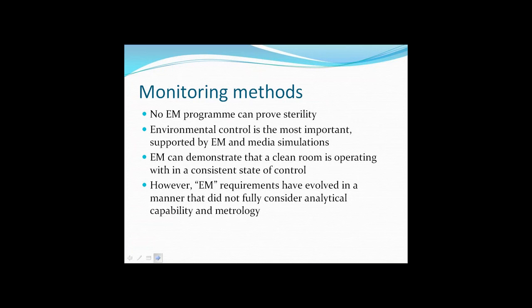It also adds a further caution: environmental monitoring requirements have, in many people's eyes, including regulators, but also the way microbiologists are perhaps sometimes interpreting the data, been applied in a way that does not really consider the analytical capability of the methods. So it's warning that we're expecting more from the methods in terms of their ability to detect low-level contamination and differentiate between a few colony-forming units than the methods themselves are really capable of achieving.